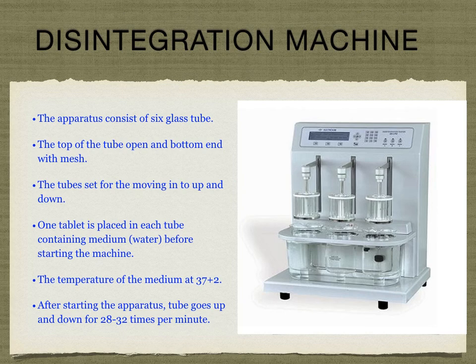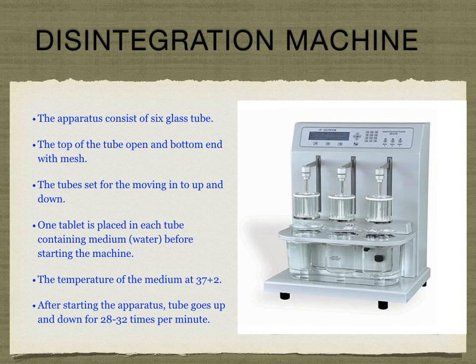This is the disintegration machine, and it consists of six glass tubes. The top of each tube is open and the bottom end has a mesh. The tubes are set to move up and down. One tablet is placed in each tube containing a medium, which is water, before starting the machine. The temperature of the medium is 37 degrees. After starting the apparatus, the tubes go up and down 28 to 32 times per minute.